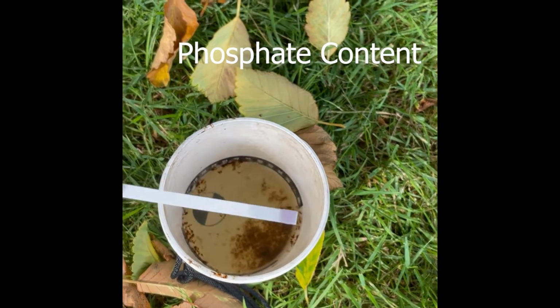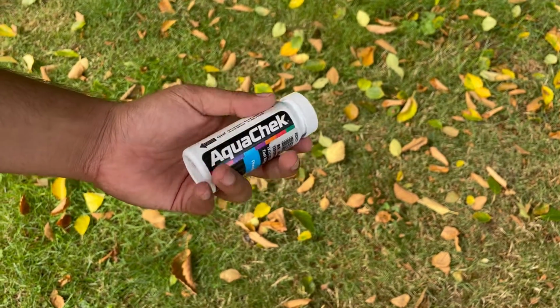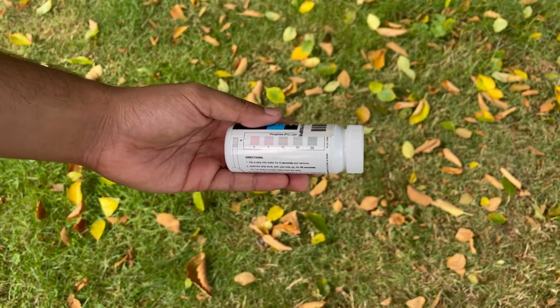Once dipped into water, compare the shade of the pad with the corresponding shade of the squares on the bottle which you got the strip from to test for the phosphate contents in the water.